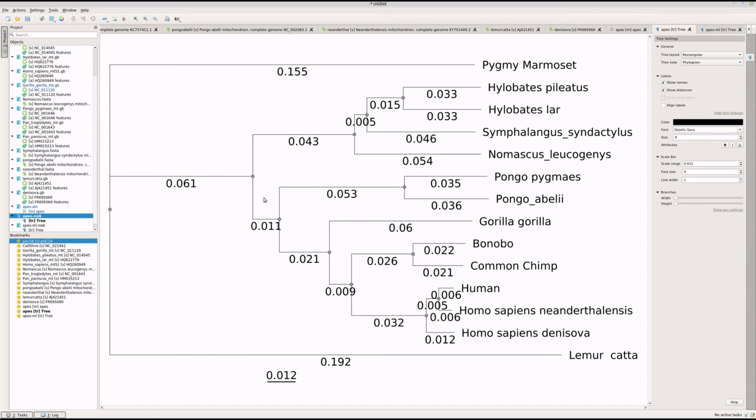Now these aren't necessarily the easiest things to look at, but you can see some differences here, right? So here we have the chimps, the humans, the orangutans, and the gibbons, but they're a little bit swapped in the way that they are branching off here. And we can definitely see the monkey and the lemur are in the distance. Now, what you can do is some other types of manipulations subsequently. And that's where these Newick files that are in our file system are very useful.